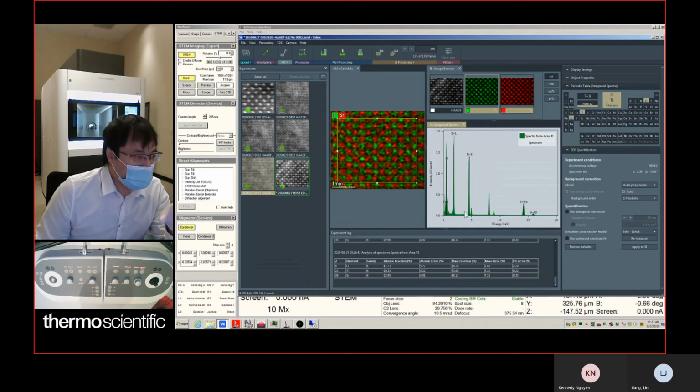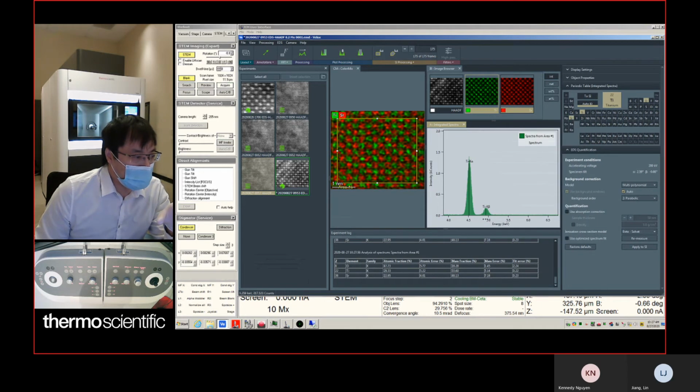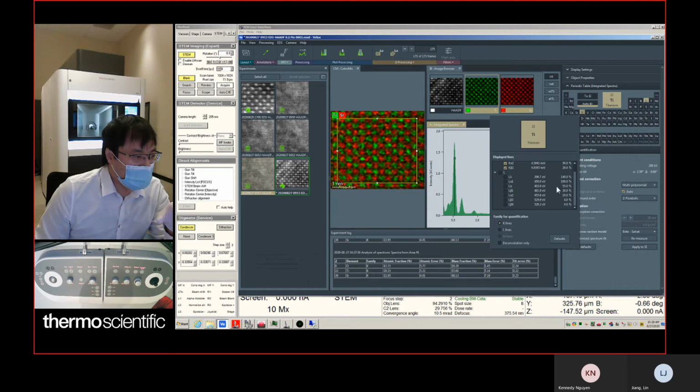You can take a look at the map, zoom in, because right now we mainly use K alpha, K beta for titanium. So we can just deselect that. That's gonna reduce noise. If you use the beta, I use the L peak. The titanium L peak is here.